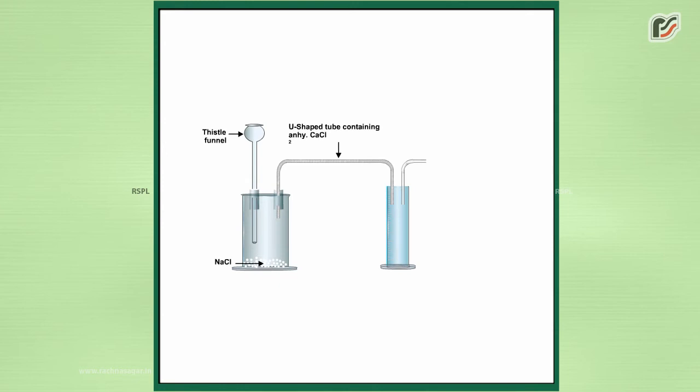Take 10 grams of NaCl in a conical flask and set the apparatus as shown in the diagram.